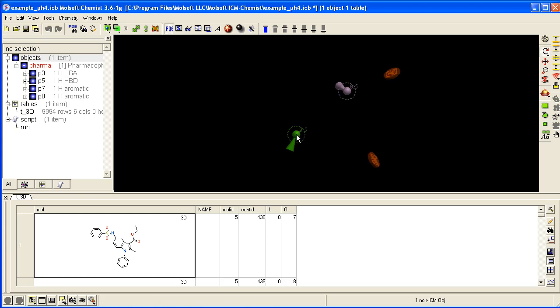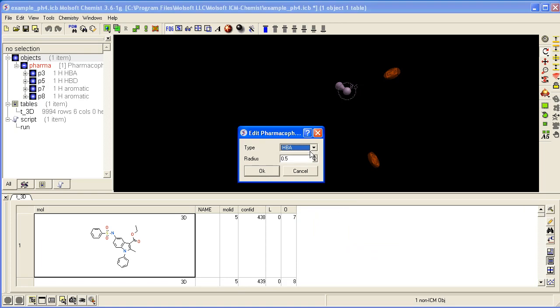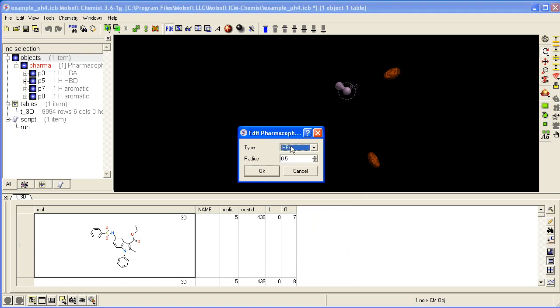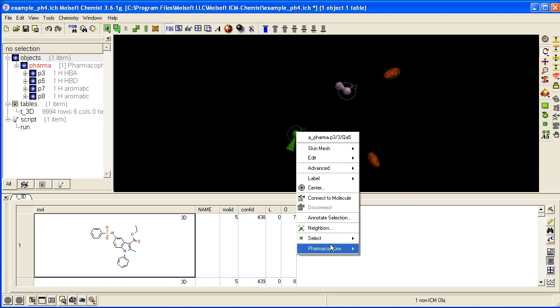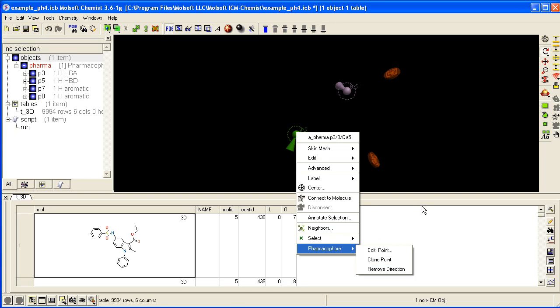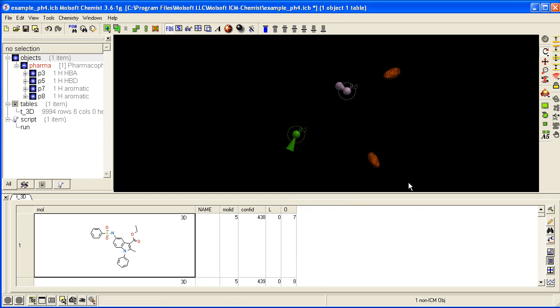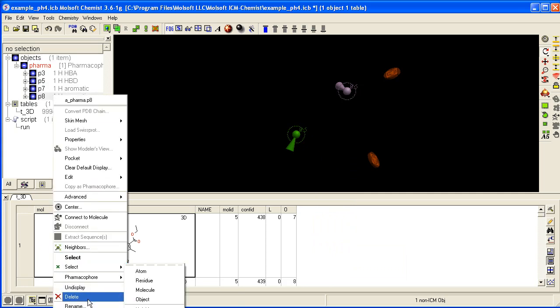To edit a Pharmacophore Point, right-click and select Pharmacophore. You can edit the type and radius, clone it to make a new version to add elsewhere, or remove direction. You can delete a Pharmacophore Point by right-clicking and selecting Delete.